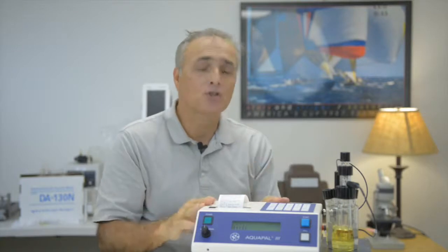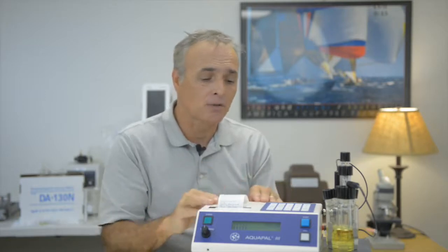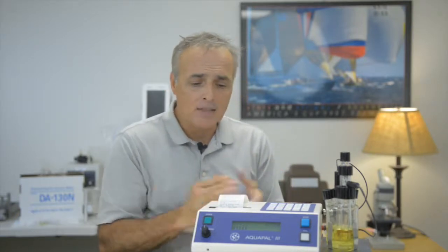You could even shut the instrument off and turn it back on and do the same thing, press the start button, because once you enter those into memory, they stay there. You don't have to have the power on for it to save that in memory. So that's an example of how easy this is to use.